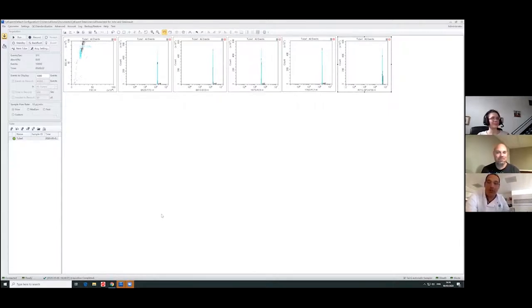Now what I want to show you is a couple of things, because this has been set up with a default setting. When you're working with very small particles, you want to go far below this side here. You are looking for something that is down here. So the first thing you need to do is change the scale. You're working in linear scale, you have to zoom out. I cannot zoom out any more than this. Yes, this is linear scale. So you need to change this and move from linear scale.